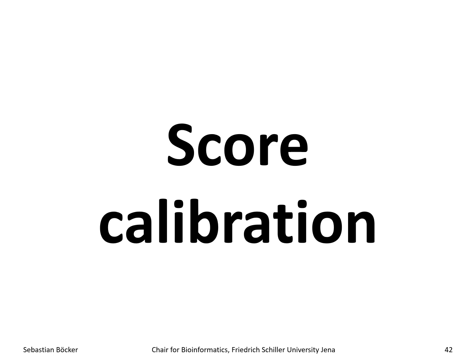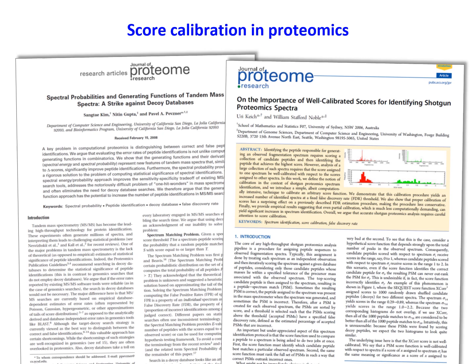And the first thing you can think of, or if you know something about that, then something you notice, is that in proteomics, score calibration has been used very successfully. So people in proteomics have very similar issues. They also search in databases, they get hits, and they want to know whether these hits are correct or incorrect. And they also found that the score itself is not really a good measure to separate correct and incorrect hits.